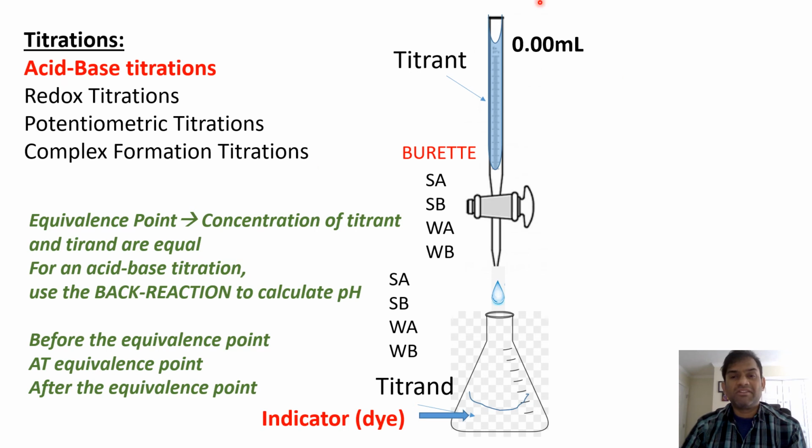This is the experimental setup, and we're going to do lots of problems where we have different combinations of the titrant, which are strong acid, strong base, with the titrand sitting in the flask, weak acid or weak base. We can flip and do all sorts of different combinations.